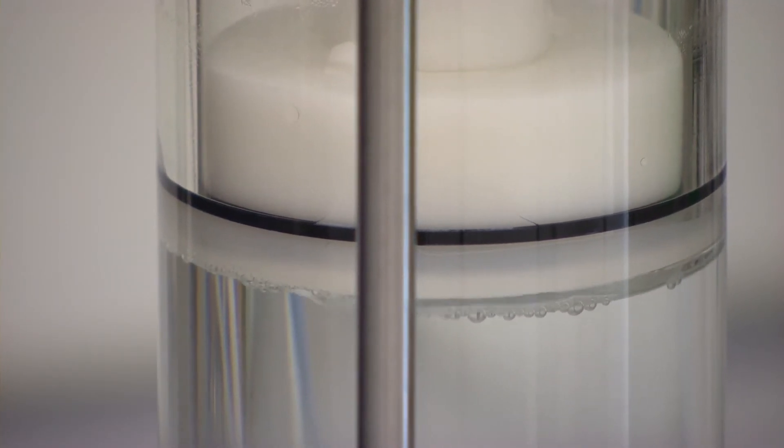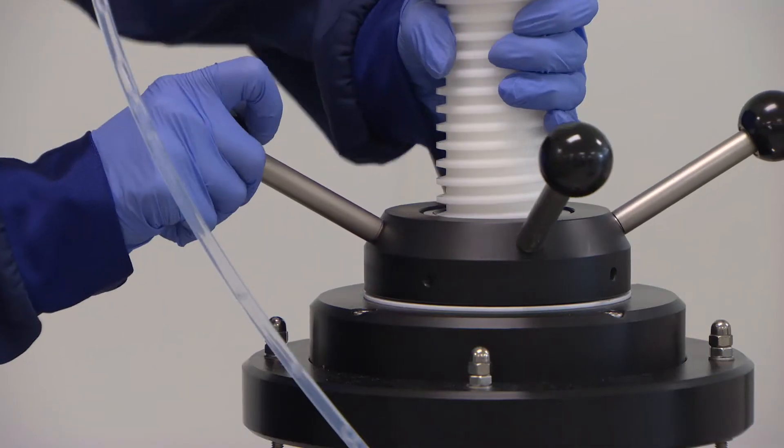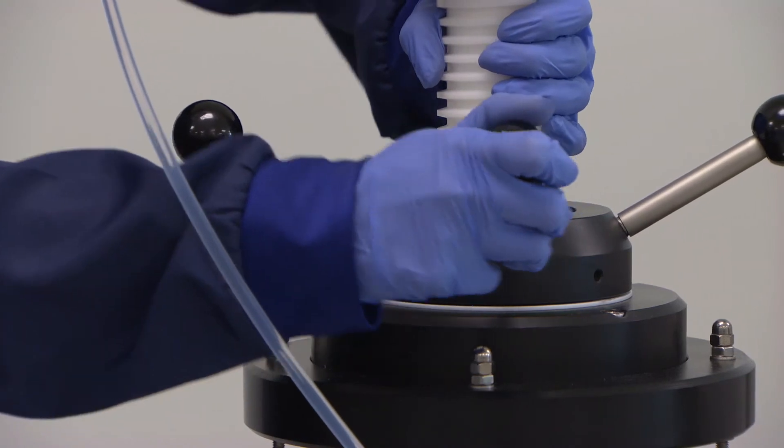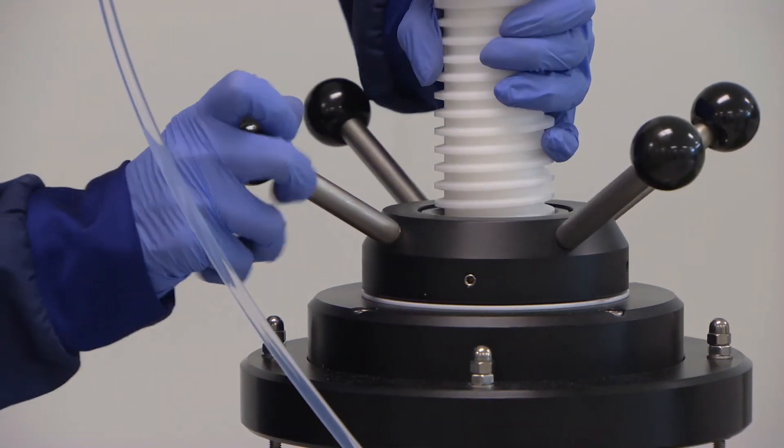As the operator lowers the top bed support, trapped air can be observed to move through the line. The piston is lowered until the line coming from the top of the column is free of any bubbles.